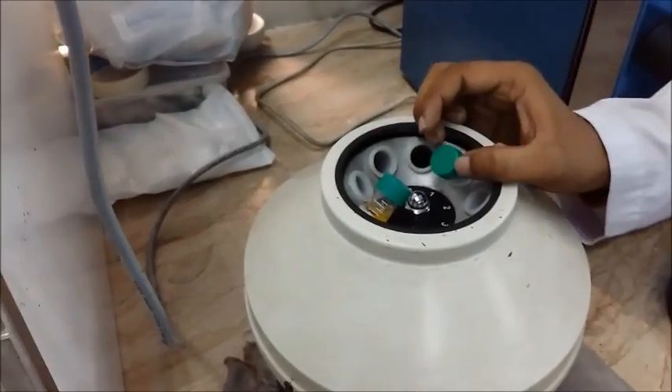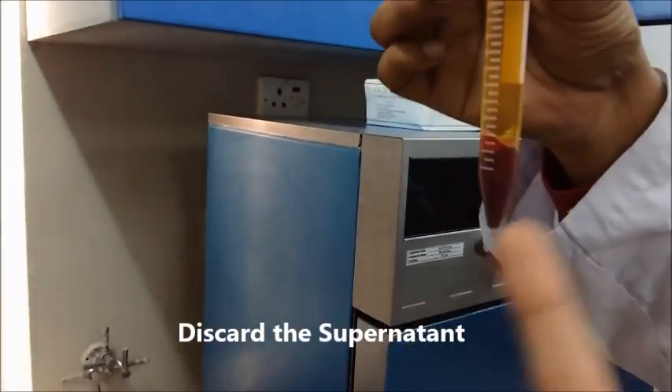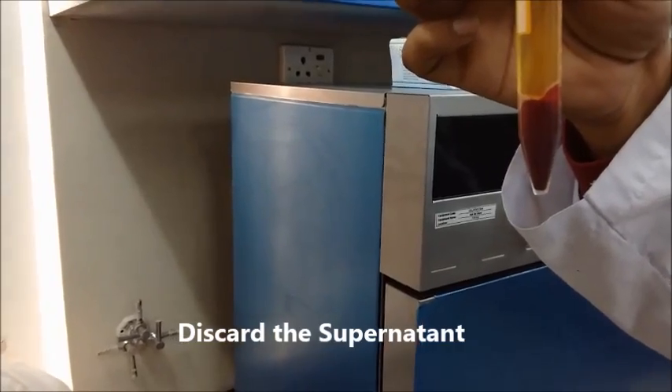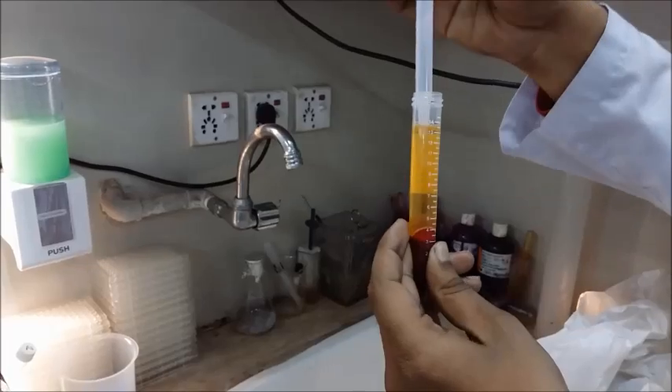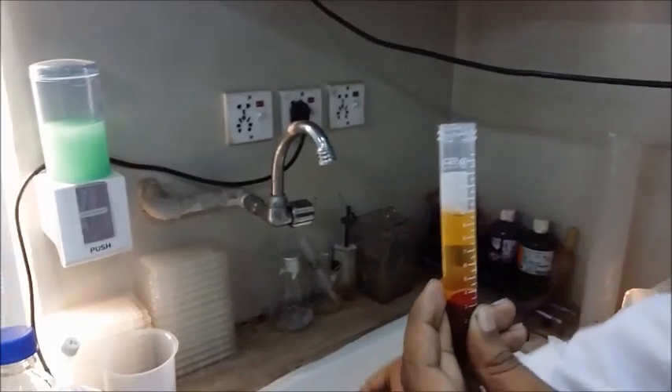After 10 minutes we take these out and you will see their appearance. As you can see, most of the blood has settled down into a pellet at the bottom of the tube. We are going to discard the supernatant. When discarding the supernatant, you need to be careful not to disturb the pellet that has formed at the bottom.